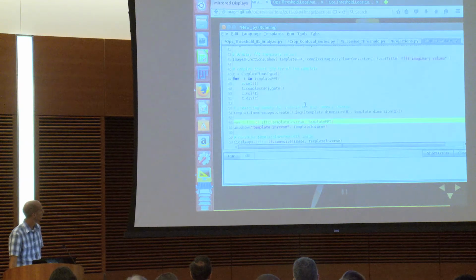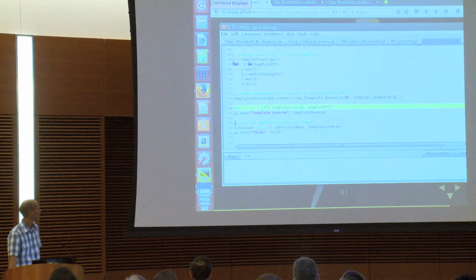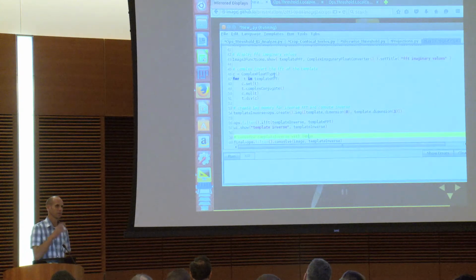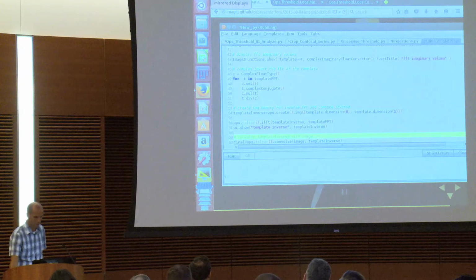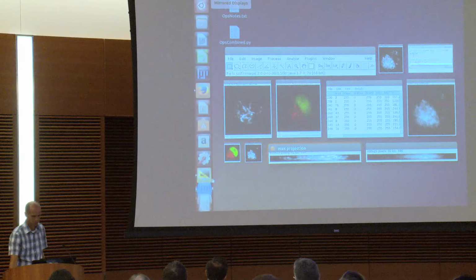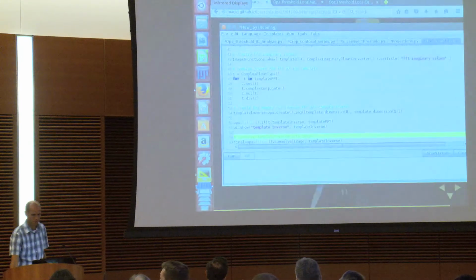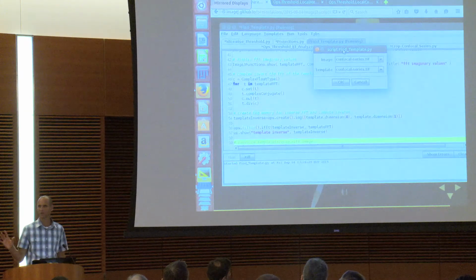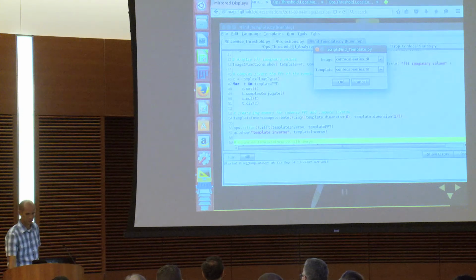And this algorithm is a template matching algorithm. What it's trying to do is take a subimage and find its location on a bigger image. Since we've only got a couple minutes, we should probably just show it. The other thing you're going to see here, somebody asked this question earlier, is that if you have two images, it lets you choose them. So I'm going to choose.